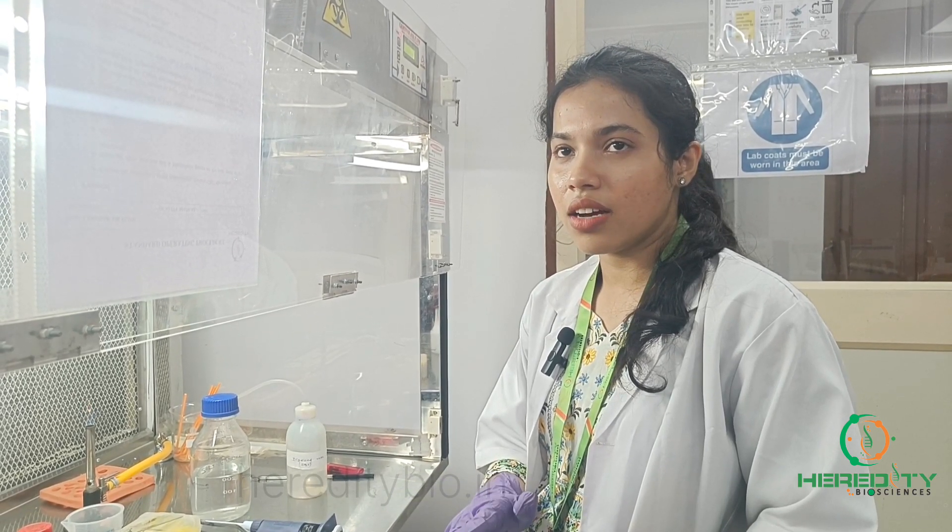Simple staining is a basic technique that is used to determine the cell morphology relative to its size and arrangement. Since bacteria are very small, they are difficult to be analyzed under the light microscope. So we'll use simple staining as a basic dye to increase the contrast of cells to be visualized under the microscope.